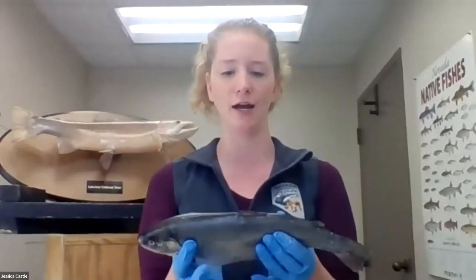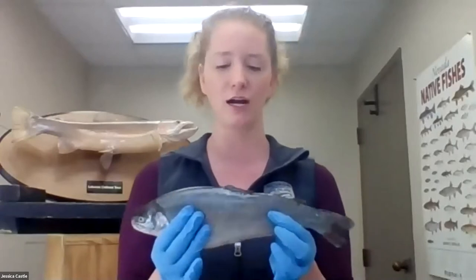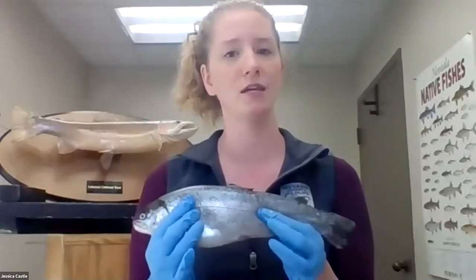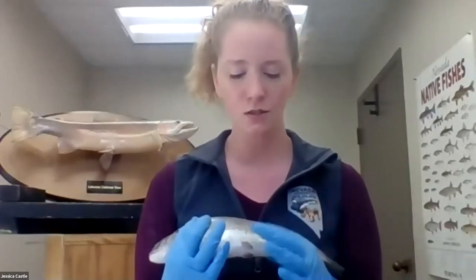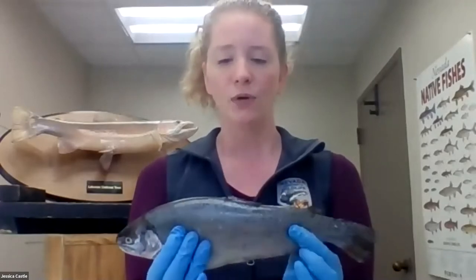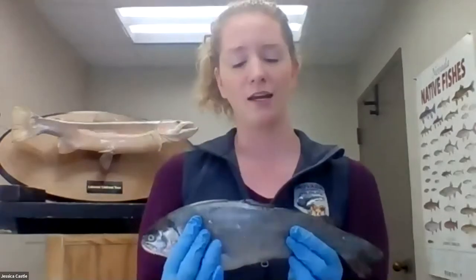Today we are going to be dissecting a trout. This particular trout is a rainbow trout — the same sort of trout that we are raising on our live stream cam, or you might have them in your classroom as well. This trout came from the Mason Valley Hatchery, so it came to us so that we could teach you all a little bit more about trout today. It has lost a little bit of its coloration due to the freezing process, but we are going to investigate this trout and learn a lot more about how it functions.